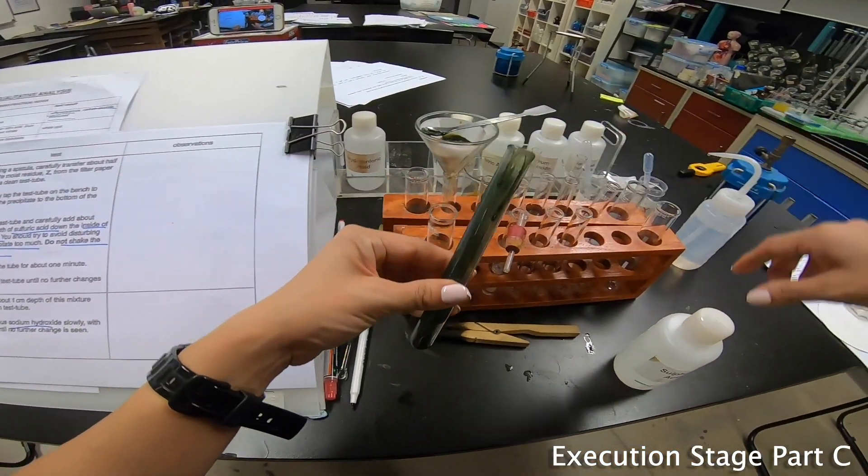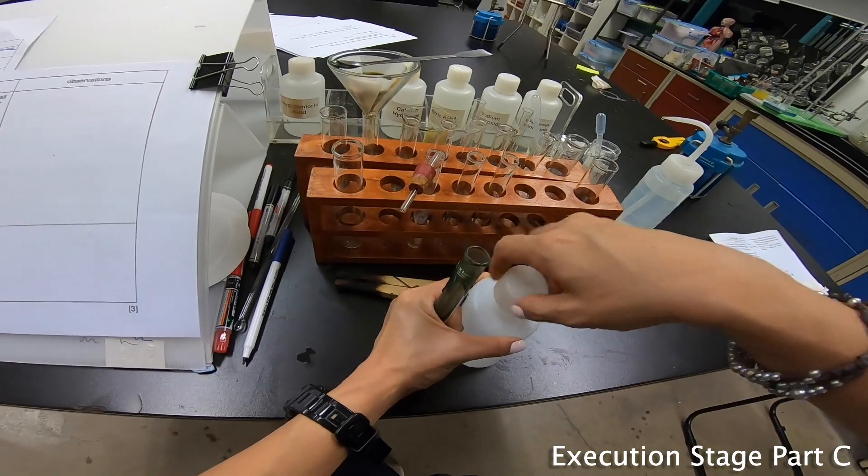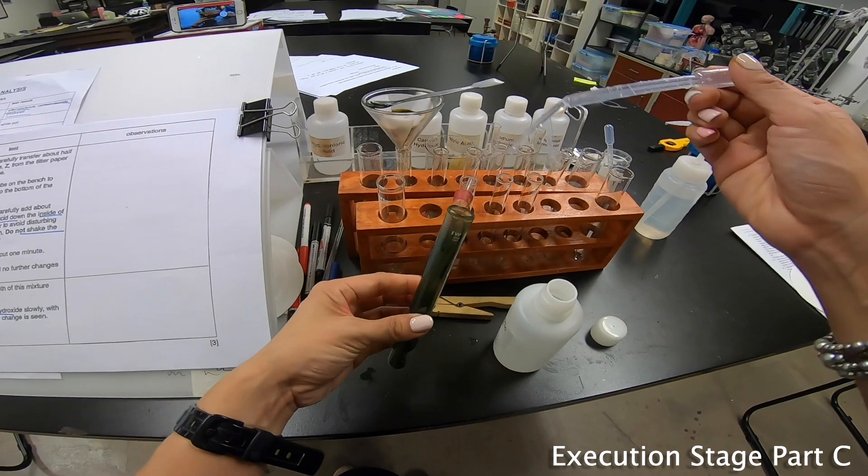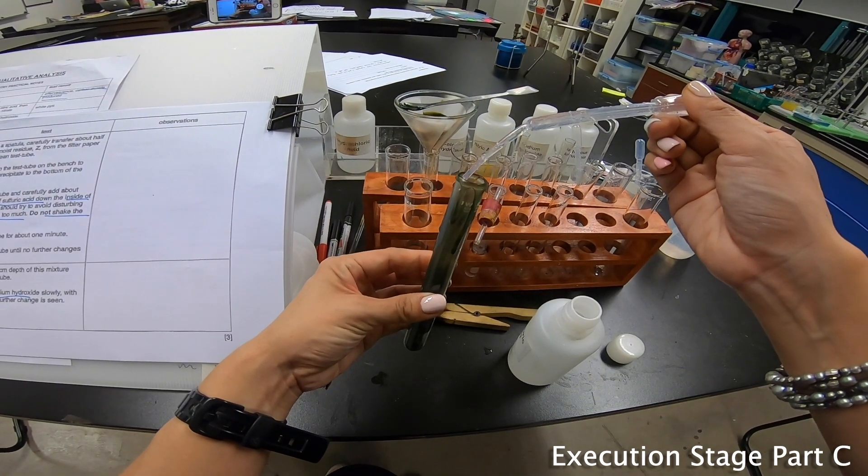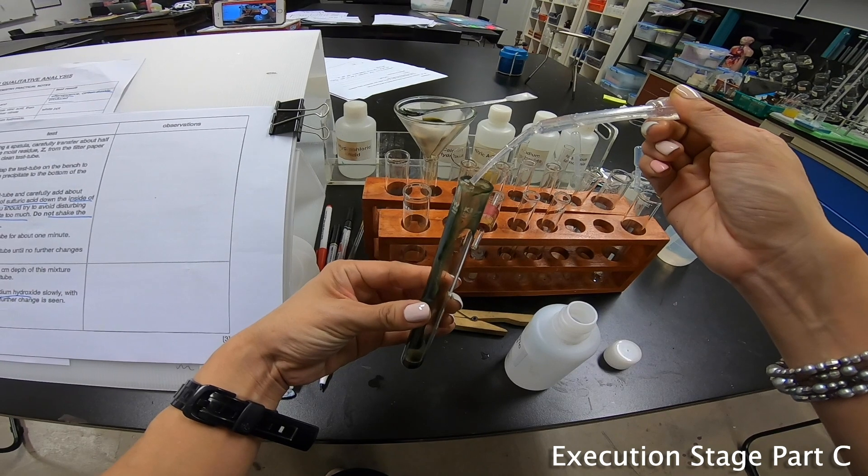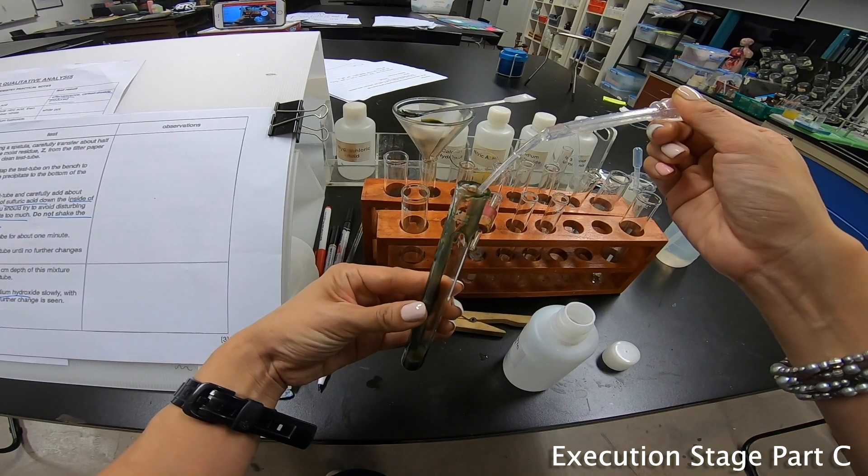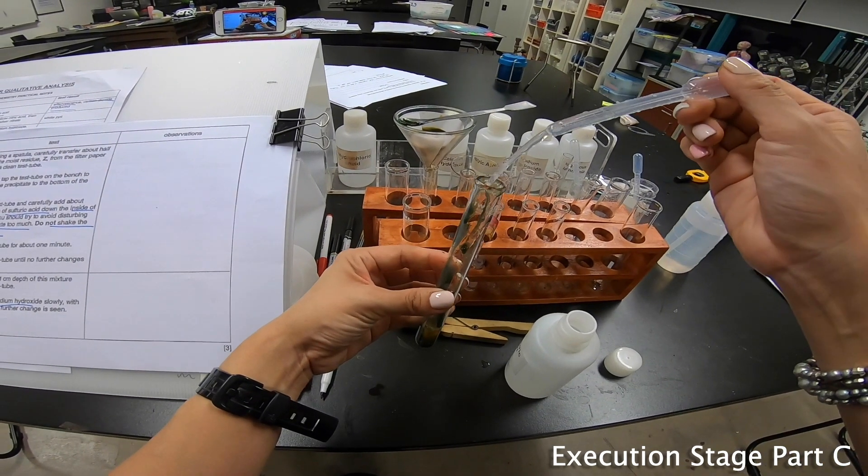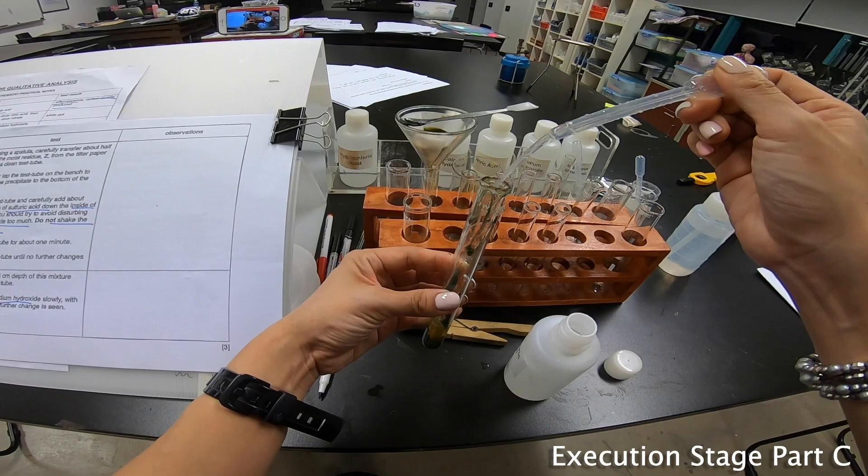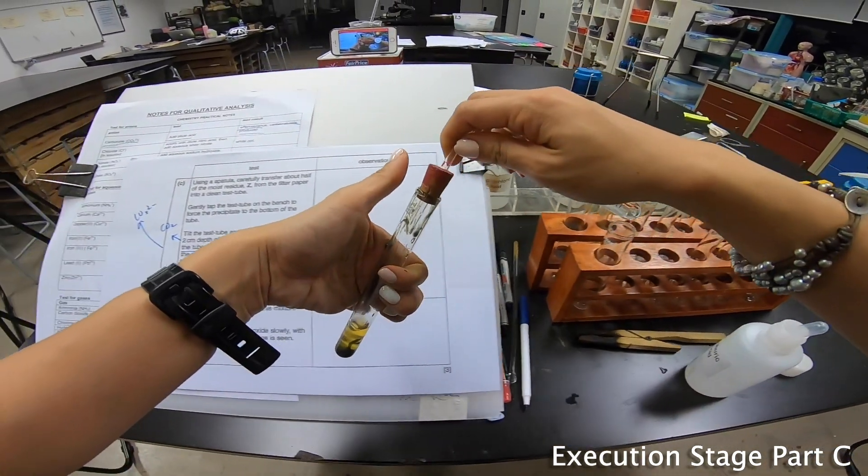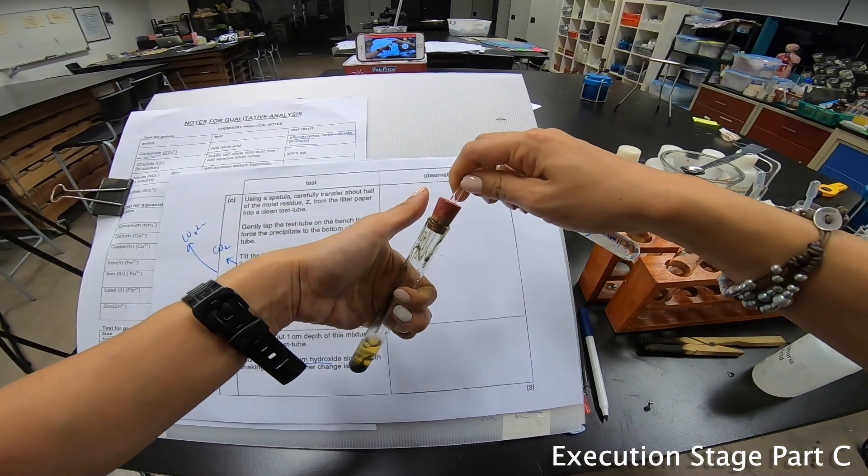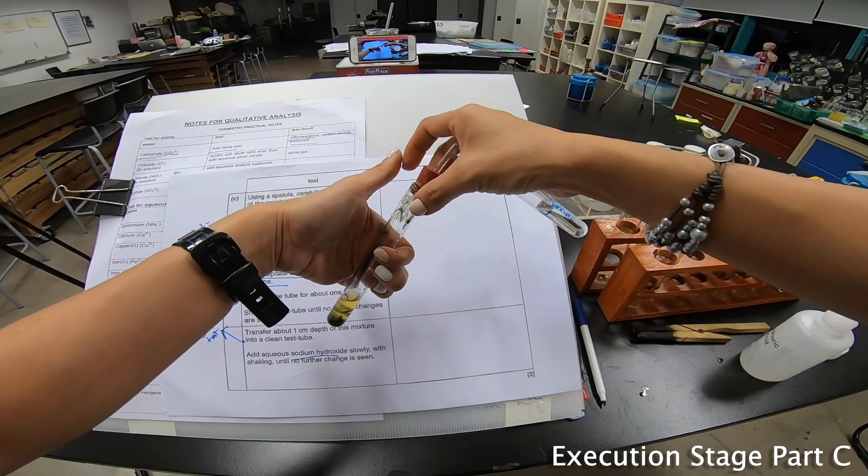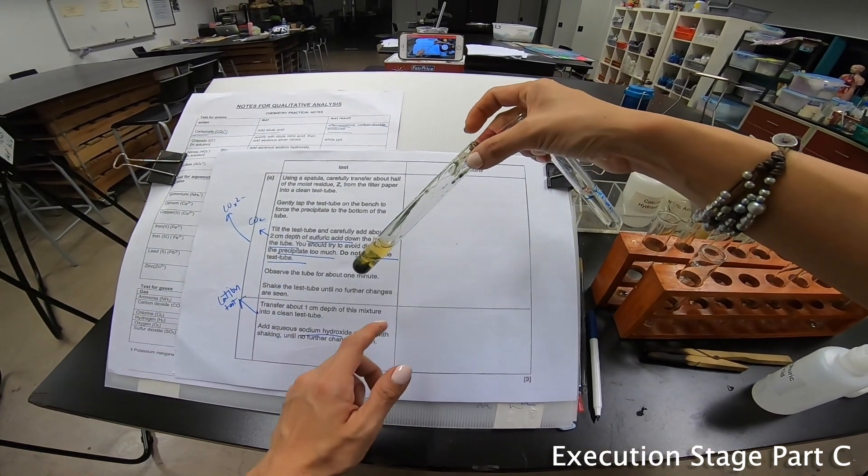Now I'm supposed to add my sulfuric acid down the inside of the test tube. Basically I think they wanted to wash it down. I see gas forming. Bubble through the lime water. But they say do not shake the test tube, so I'm not shaking it.